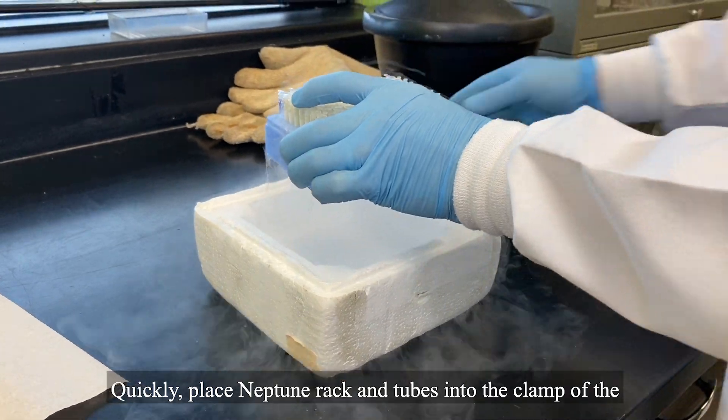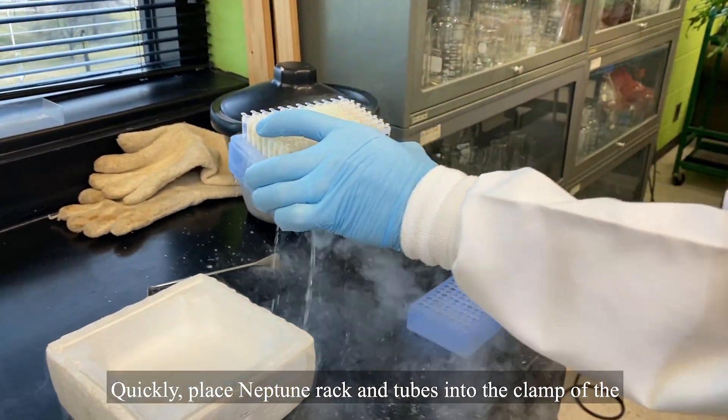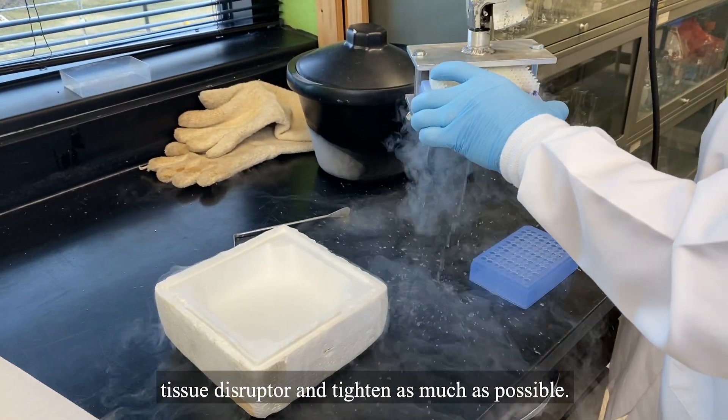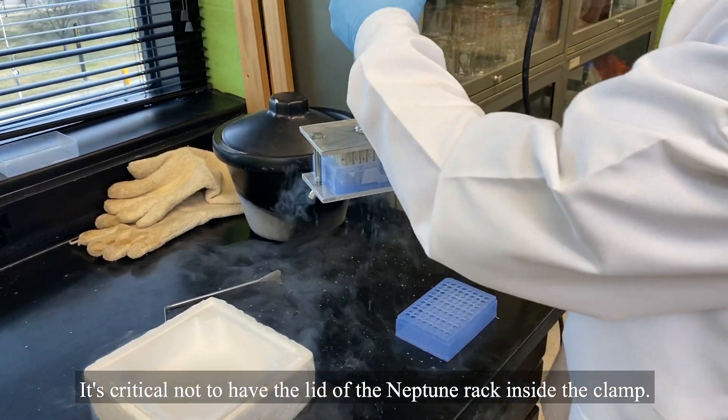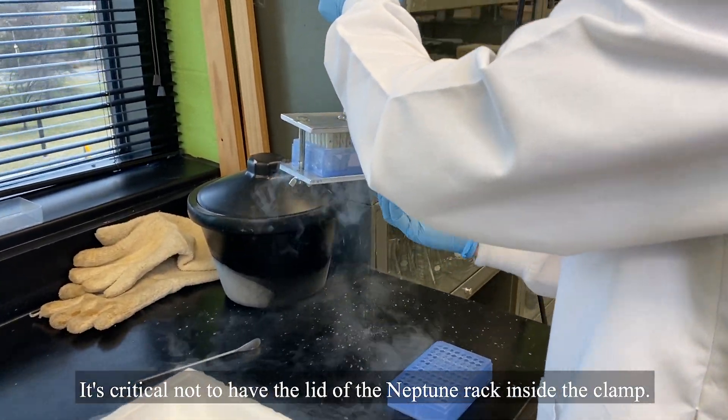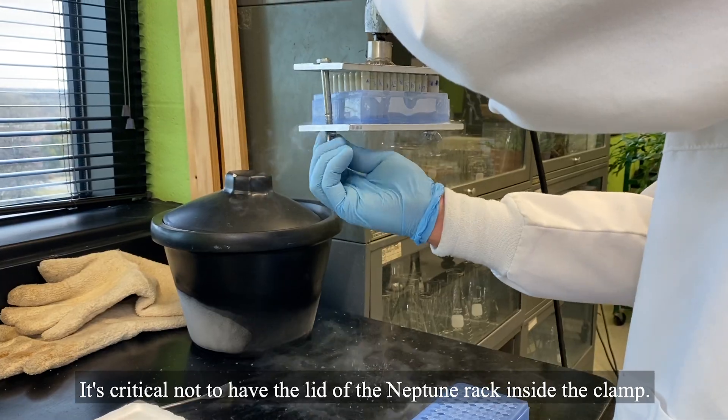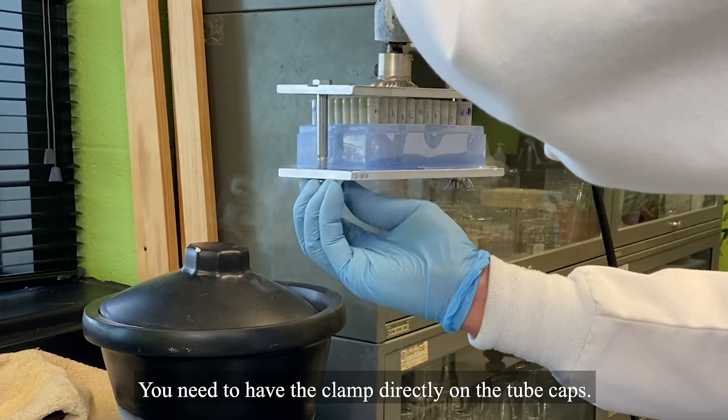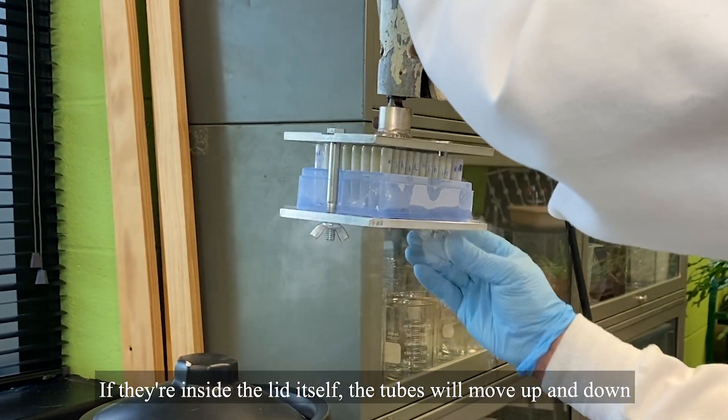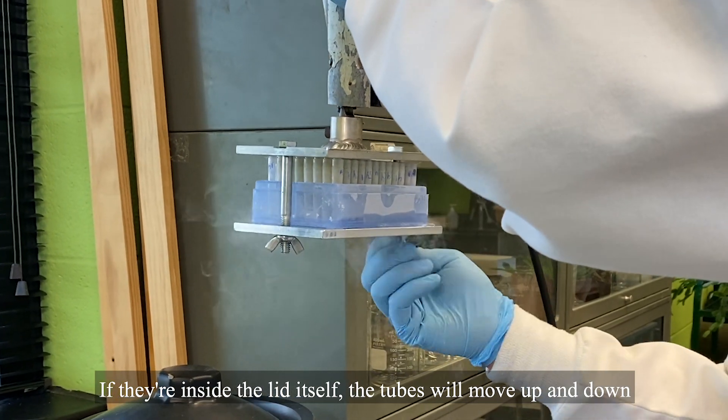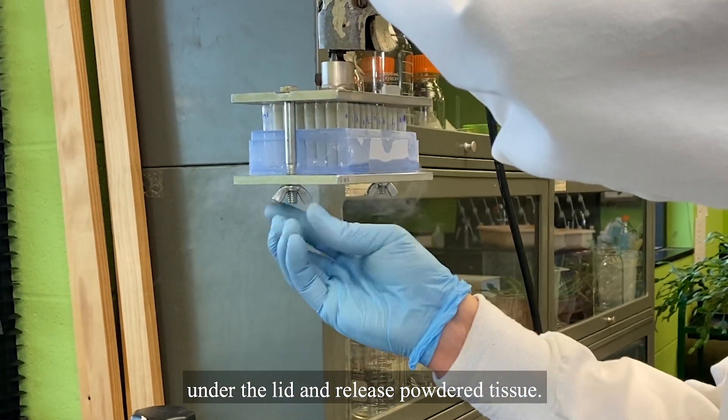Quickly place the Neptune rack and tubes into the clamp of the tissue disruptor and tighten as much as possible. It's critical not to have the lid of the Neptune rack inside the clamp. You need to have the clamp directly on the tube caps. If they're inside the lid itself, the tubes will move up and down under the lid and release powdered tissue.